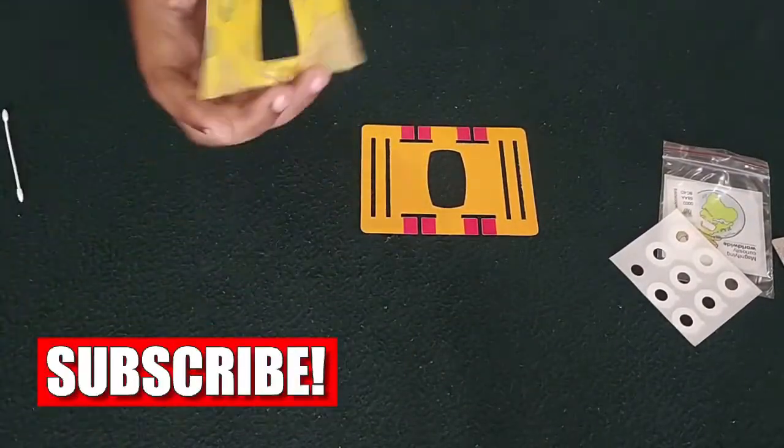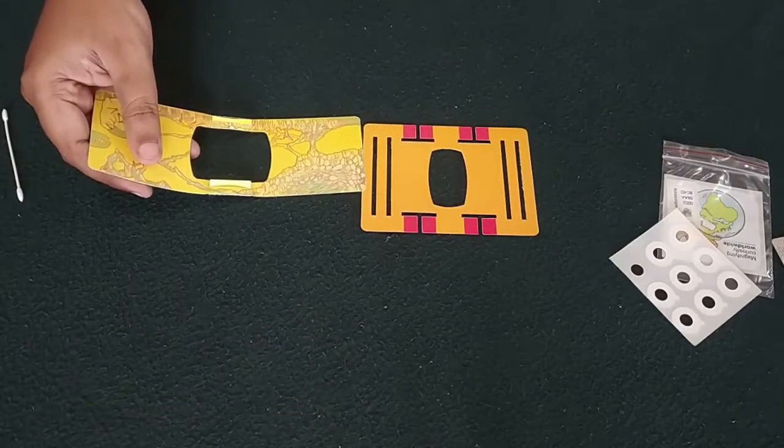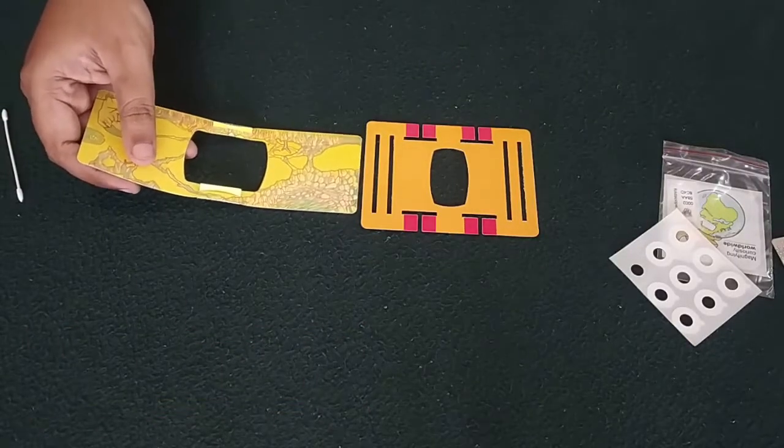Now taking this part and this, we need to insert this sample sheet through this.